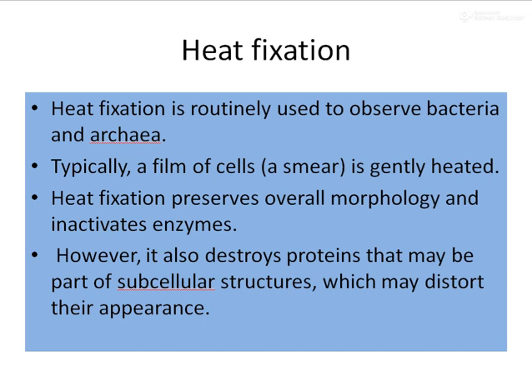As the term implies, heat fixation is a technique in which heat is applied so that the bacterial cells or microorganisms get fixed onto the glass slide. In bacteria and archaea, we routinely use heat fixation; the overall cell morphology is preserved and you inactivate the enzymes. But as you know, proteins are heat sensitive, so the proteins get destroyed, and subcellular structures might also get distorted by heat fixation.